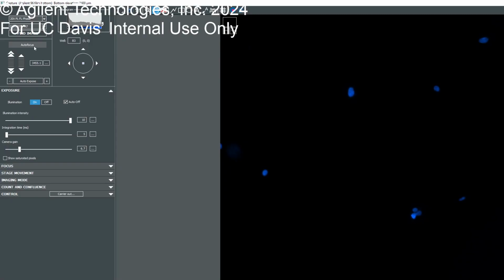And then it just sets up an offset from the bottom of the well plate, how far off the cells are. And that distance is going to be static across the whole plate. The bottom thickness is the only thing that's going to change, irrespective of whether this distance is like 3405 or 3455.